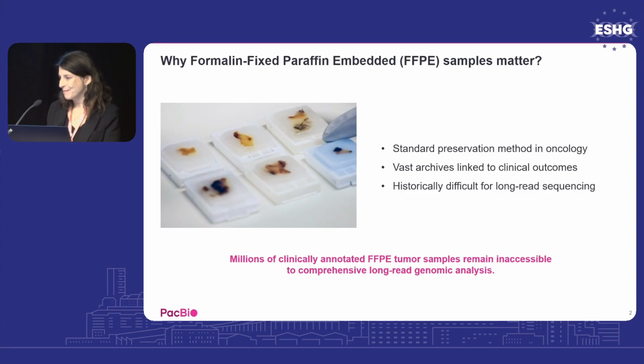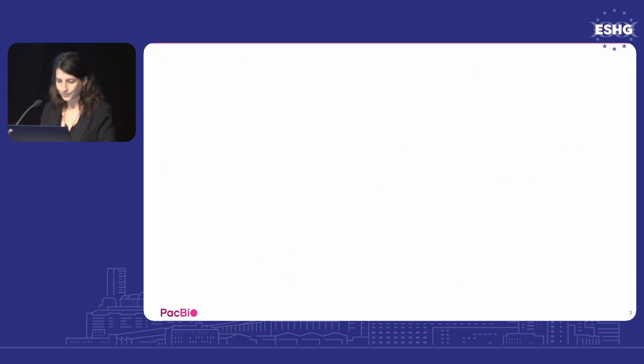And honestly, before being a product manager, I used to be an FAS working directly with customers. And when someone was asking me, can I sequence an FFPE sample with PacBio, I was like, no, I don't think it's a good idea. So yeah, I'm very happy today that we have something that looks much better.